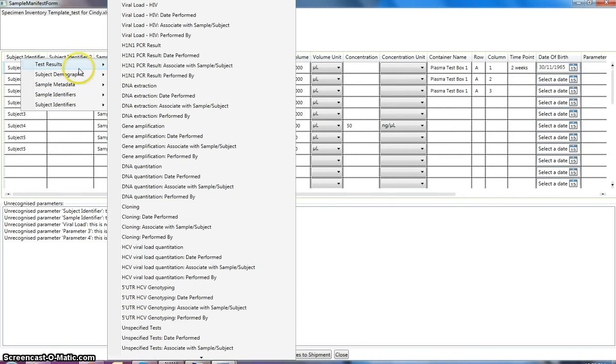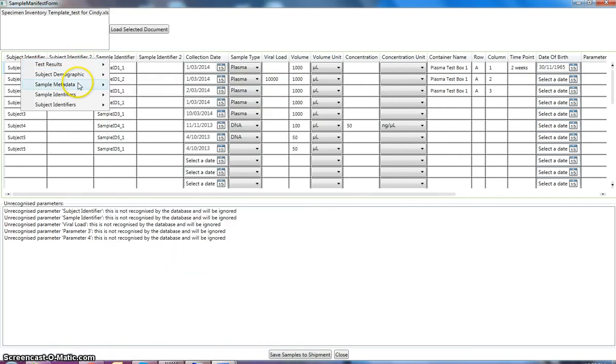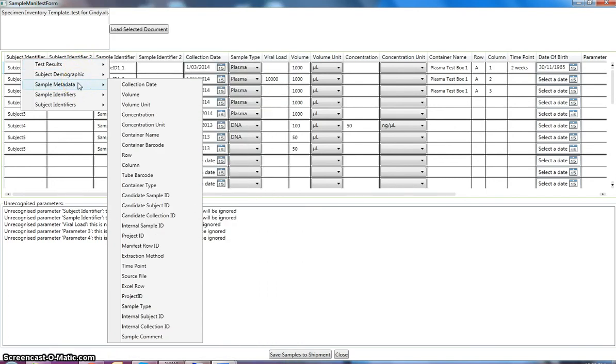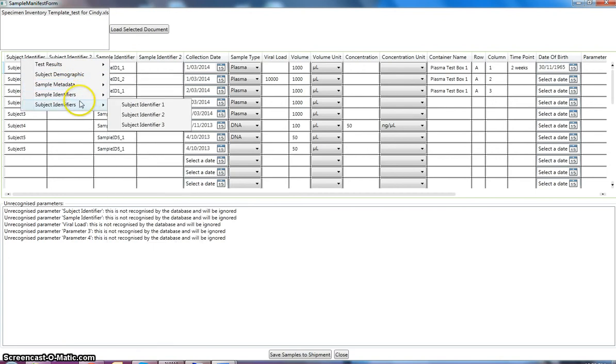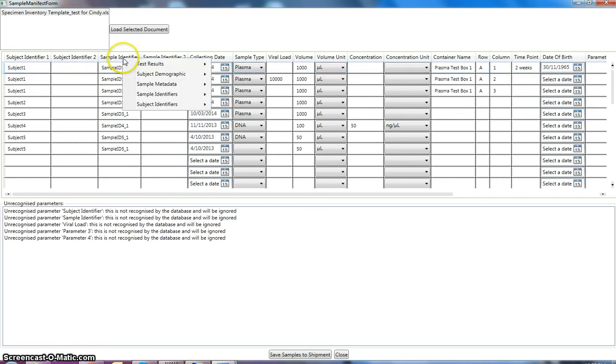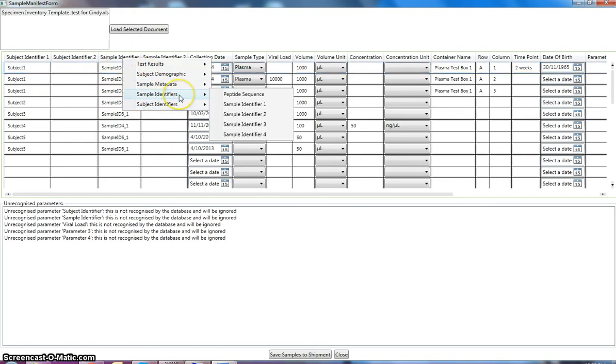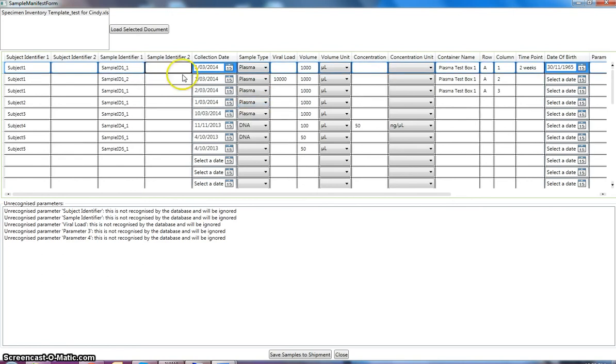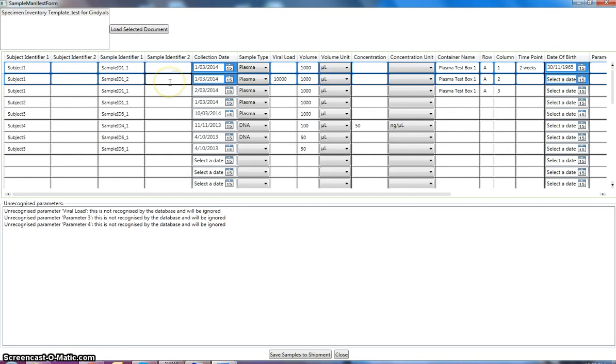So if we click on the header, one of the headers that it doesn't recognize, we've got a list of categories of data that metadata types that we can assign to this column header. So in this case, we want a subject identifier. And in this case, it's subject identifier one. And the same thing over here. So that's actually a sample identifier. So we want to actually tell the system that this is referring to sample identifier one. So if we click into another cell, we can see we've still got a column viral load, which is not recognized by the system.